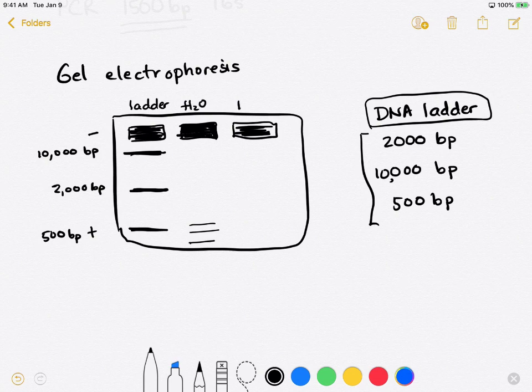You then looked at samples 2 through 4, where we had added DNA. This is where we were trying to amplify that 16S ribosomal subunit. And in this case, hopefully you saw a nice large band, maybe some leftover products below, but this large band that should have been about 1,500 base pairs big. This was the exciting piece.